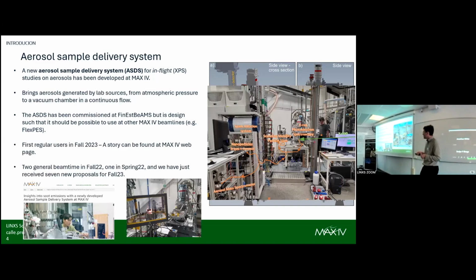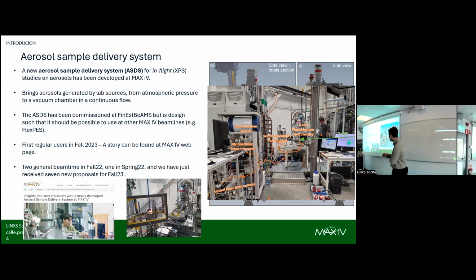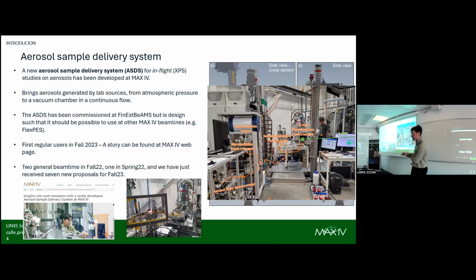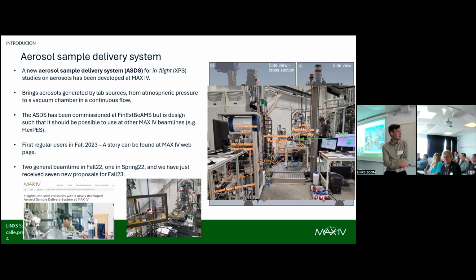We had our first users in the fall of 2023, and they were measuring soot particles from a flame. You can see on the bottom image here that they brought their soot generator, and they had an open flame in the hall, and then the particles enter the system.